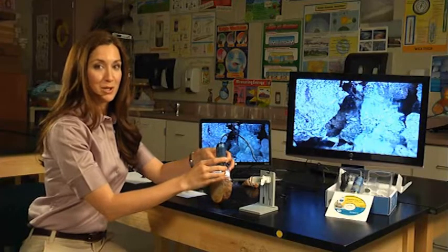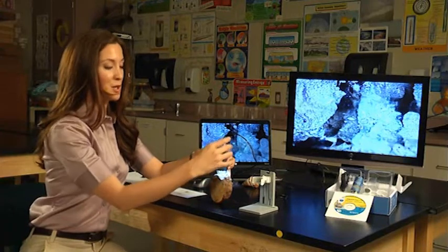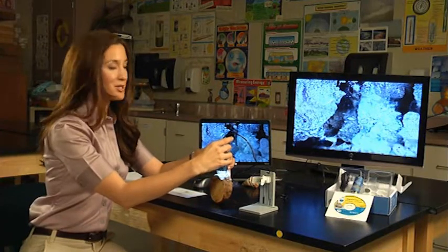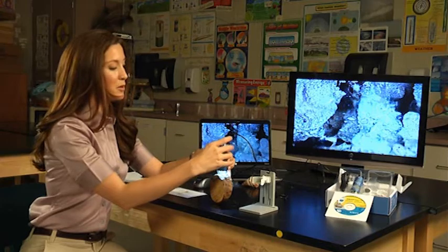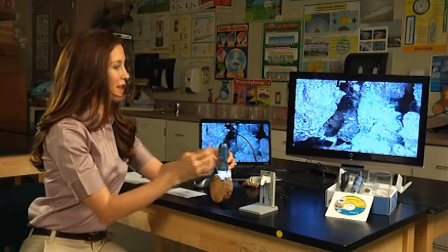You'd never be able to do this with a traditional microscope. And with the SmartScope 5M, you can take great pictures. So I'm just going to press the photo button right there at the top to capture that image.